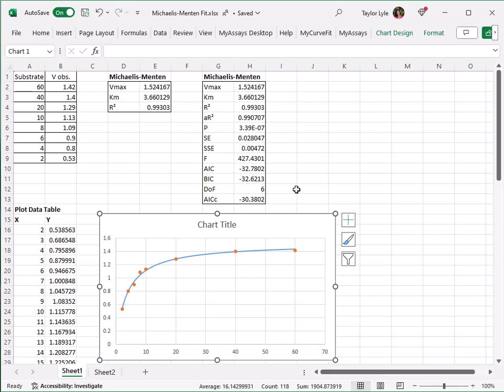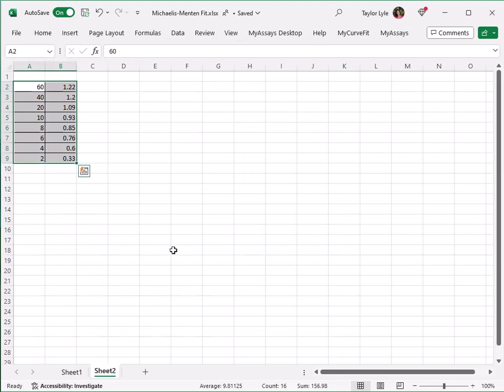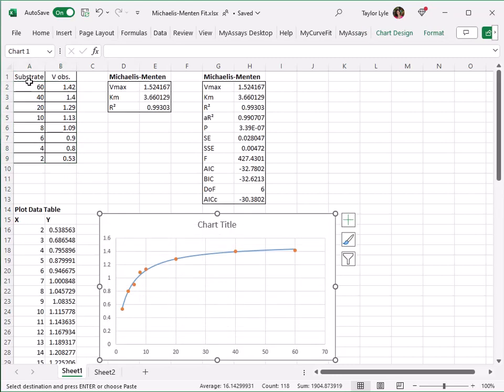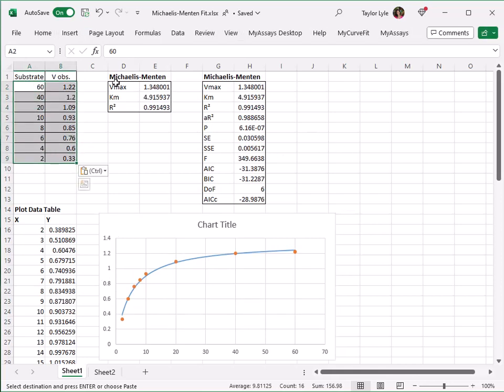Another excellent benefit of using the MyCurveFit XL add-in is the ease of analyzing additional data sets. All I need to do to analyze my next data set is to simply copy and paste in the calibrator data. I have another data set on sheet 2 of this spreadsheet. Highlighting those values, I'll copy and paste these into our existing calibrator table. You can see my curve fit parameters are automatically updated, as well as the chart.